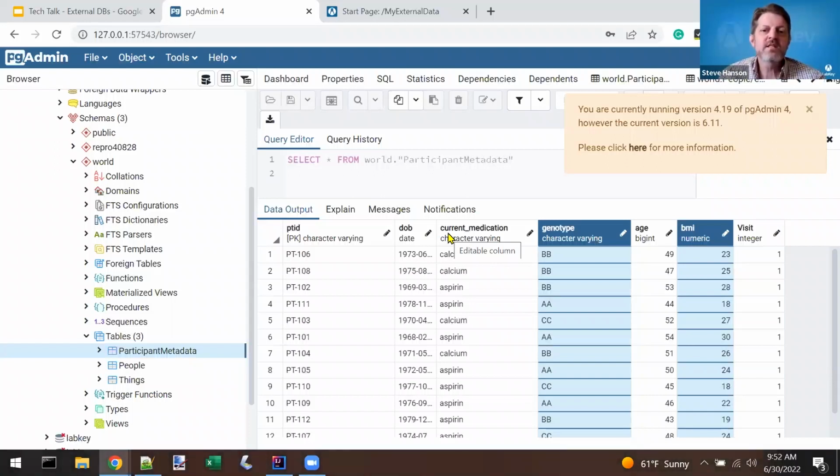Also, as you can see, this is clearly the kind of data that you might want to surface in a LabKey study as part of a larger effort. You maybe are collecting data on patients over time for some study, and this could be useful metadata in that study.